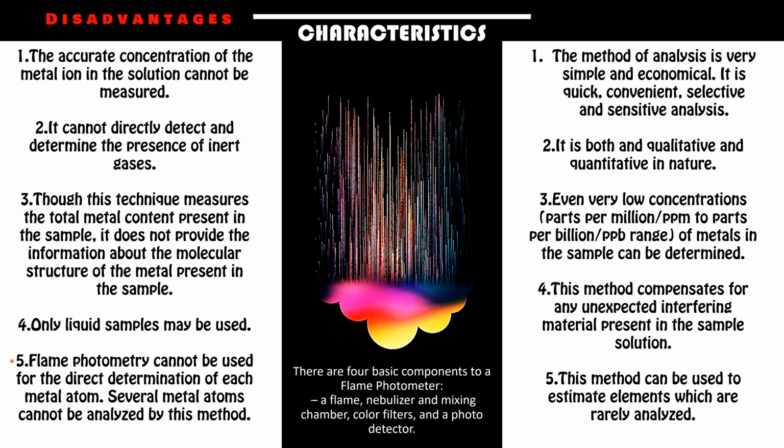Now the question: why is the flame photometer not used for nonmetals? It is because metalloids and nonmetals generally do not produce isolated neutral atoms in a flame, but mostly polyatomic radicals and ions. Therefore, nonmetallic elements are not suitable for determination by flame emission spectroscopy, except for a very few and under very specialized conditions. Now let us look at the brighter side, the advantages.